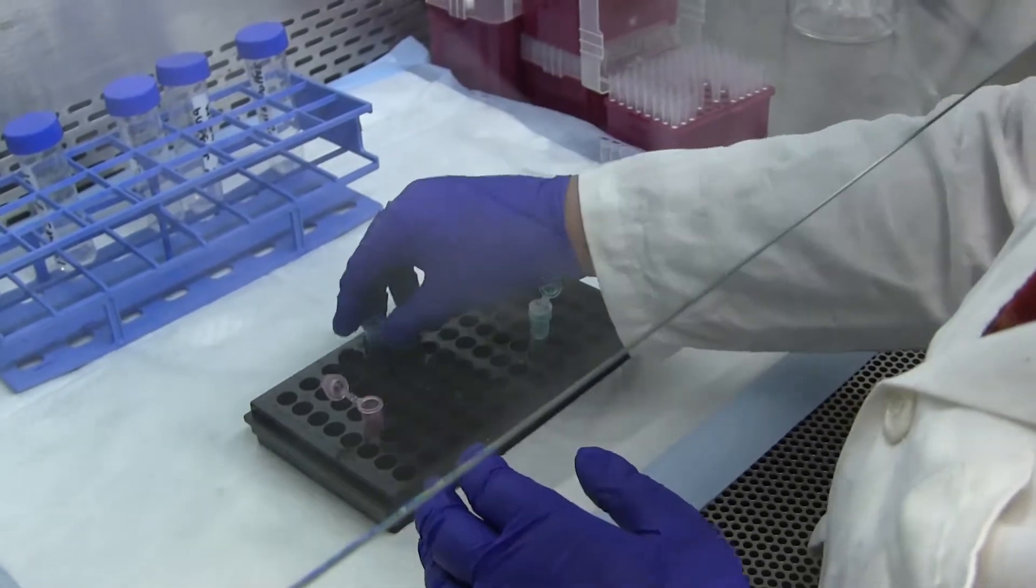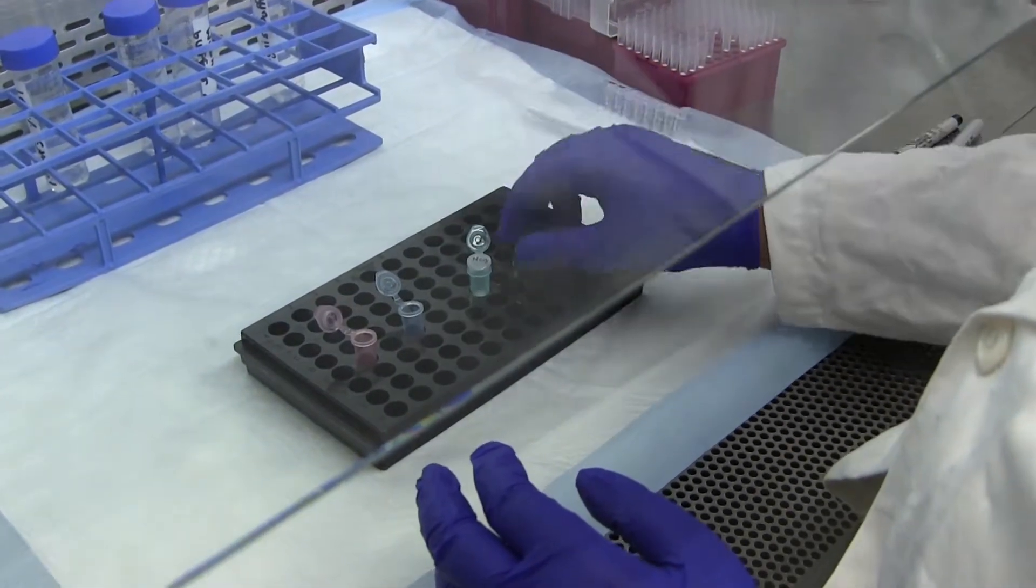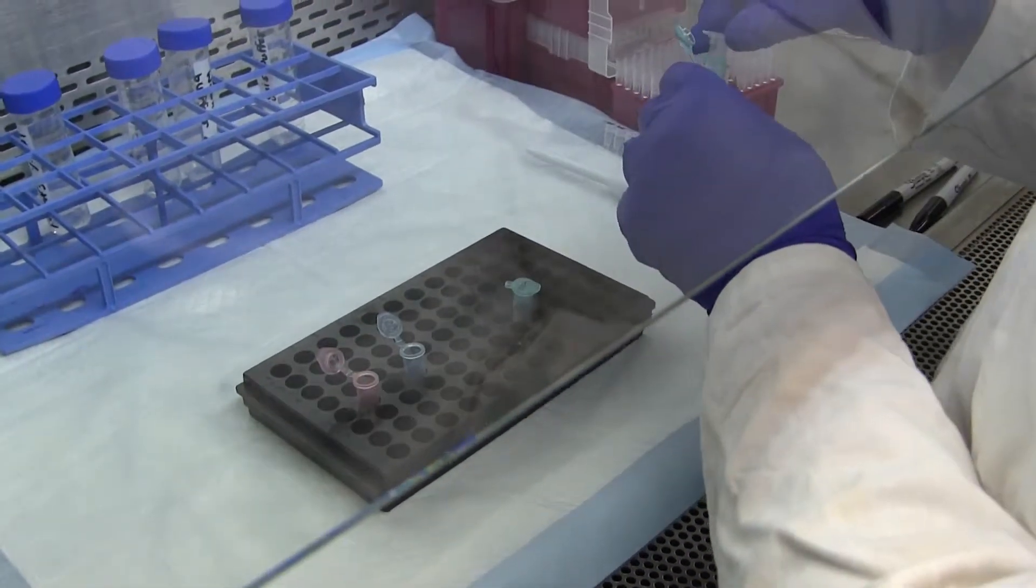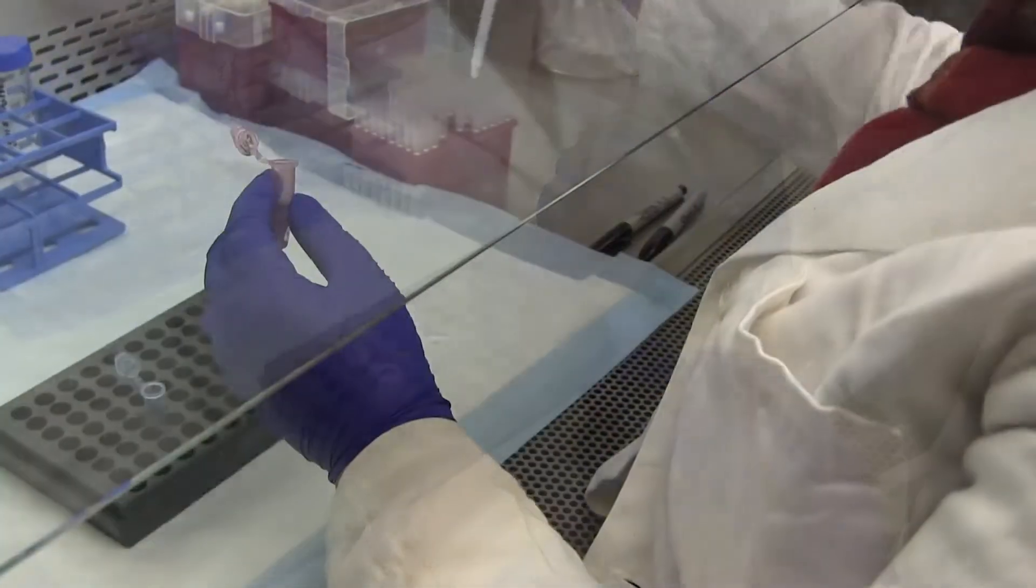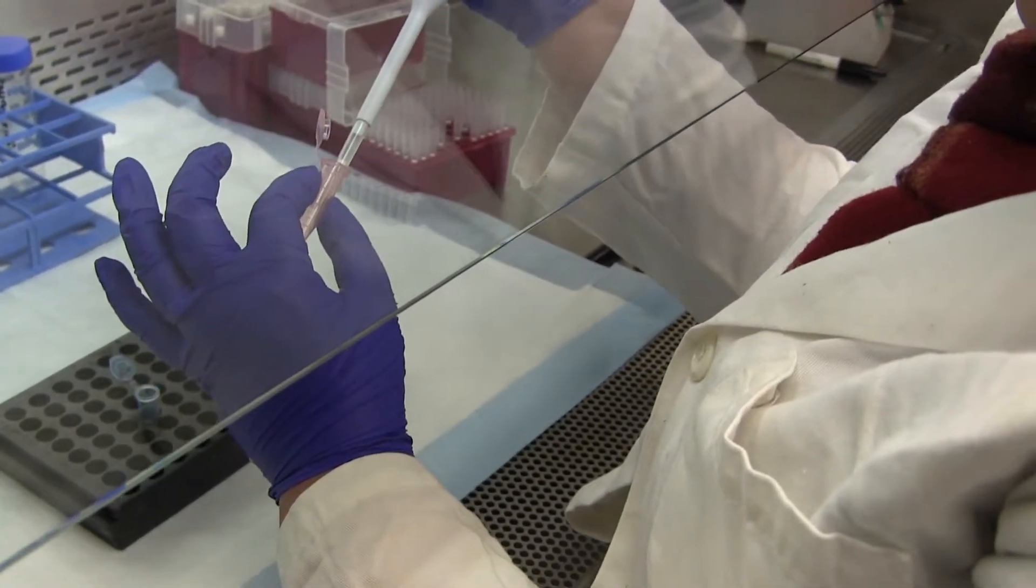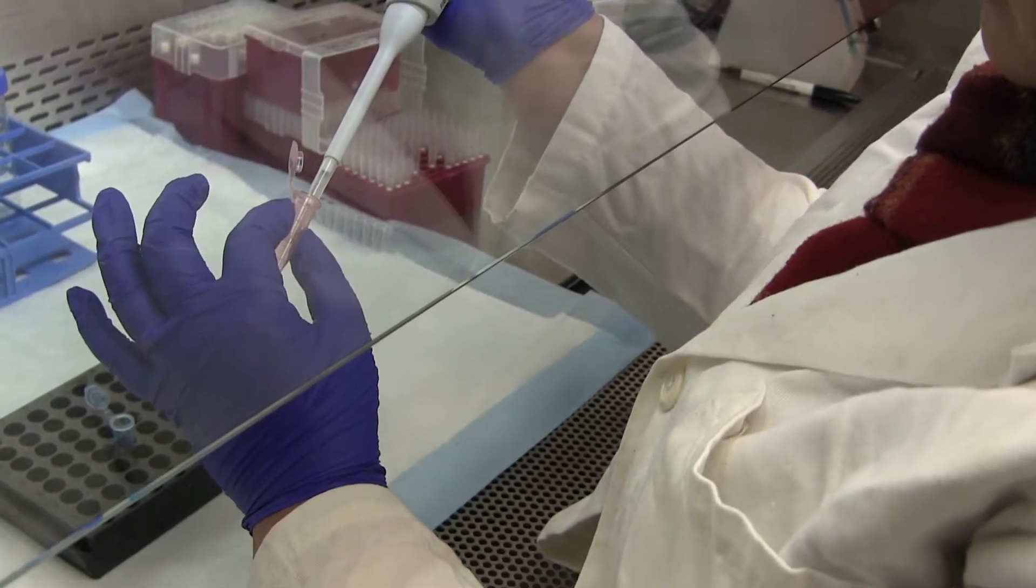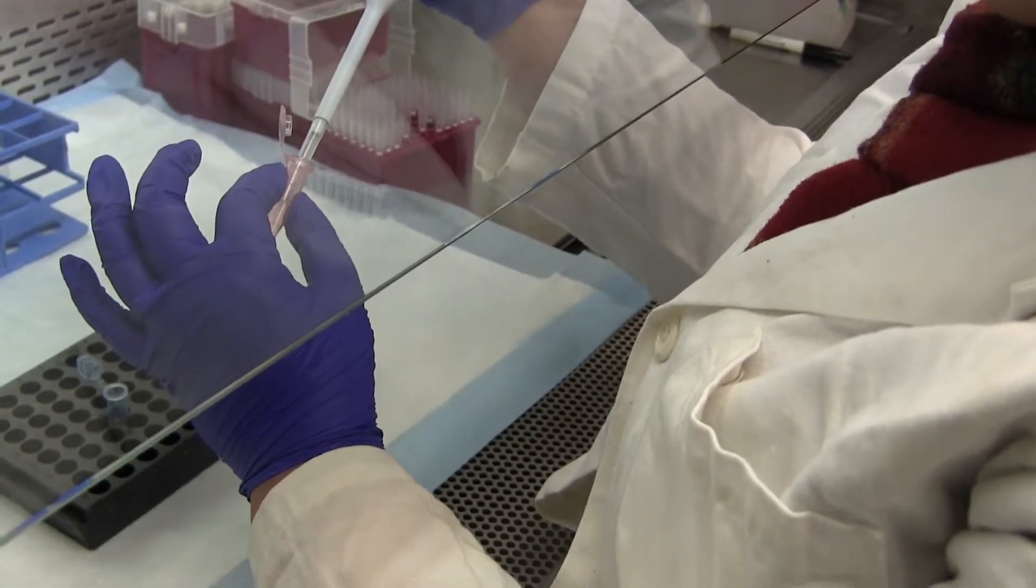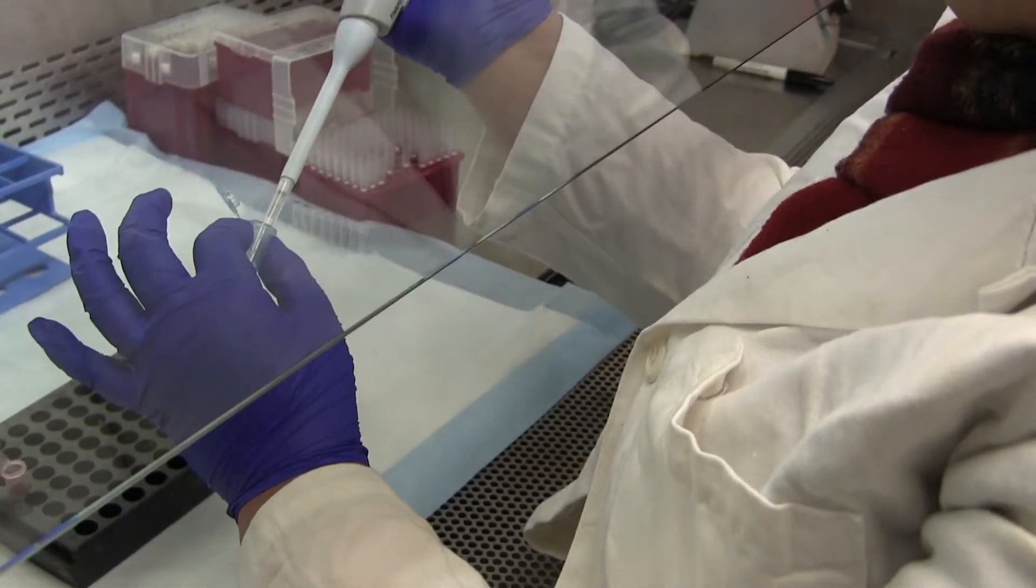So now you can discard the columns, and you see how these caps are all crooked from centrifugation. And now you can transfer the eluent to a fresh tube that's been pre-labeled. And then you are done.